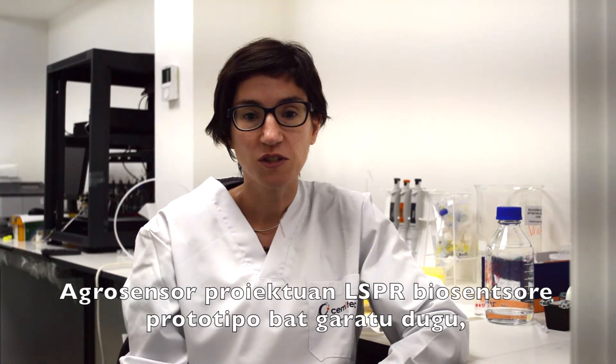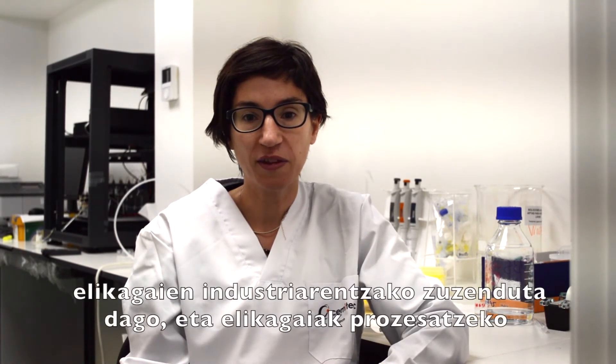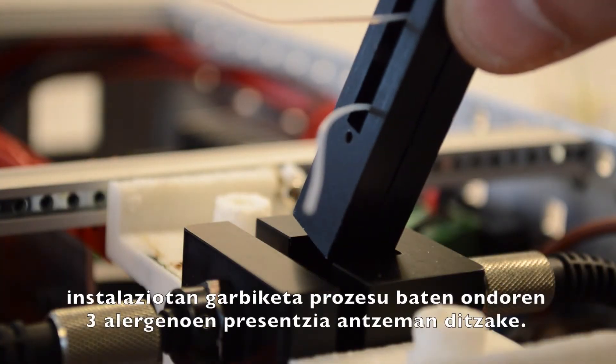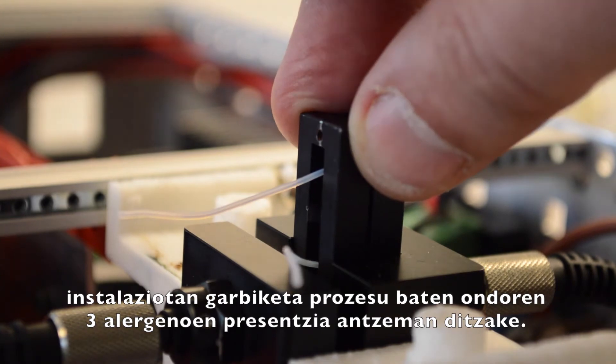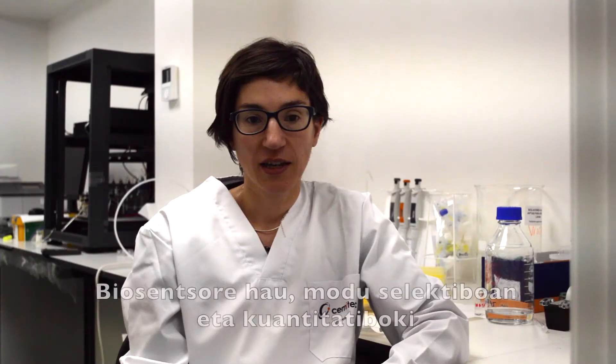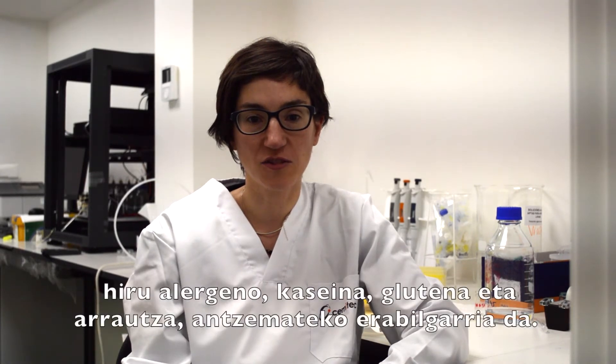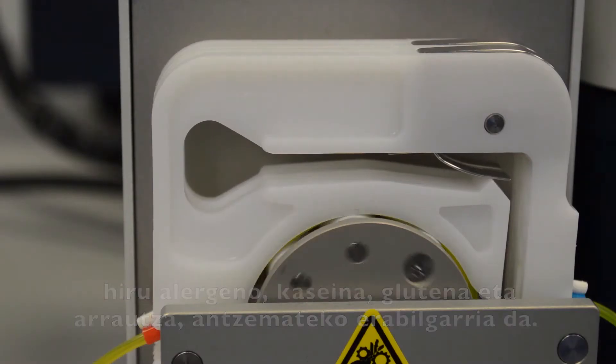En el proyecto AgroSensor hemos desarrollado un prototipo biosensor LSP-R específico para la industria alimentaria que permite determinar la presencia de tres alérgenos en instalaciones de transformación de alimentos tras un proceso de limpieza. Este biosensor es especialmente útil para la detección selectiva y cuantitativa de tres alérgenos: caseína, huevo y gluten.